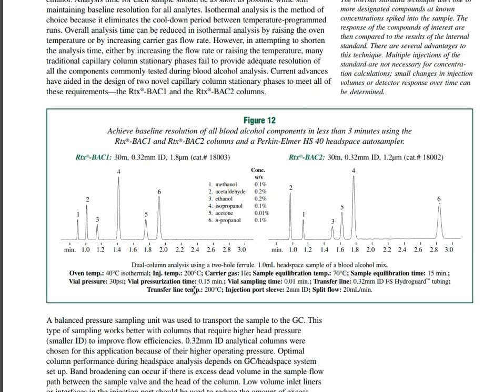The transfer line temperature is set at 200. When we suck things out of there, we don't want them to condense down in the transfer line. So this thing has to be heated too. That's why that tube is pretty thick. You saw that in the previous pictures.